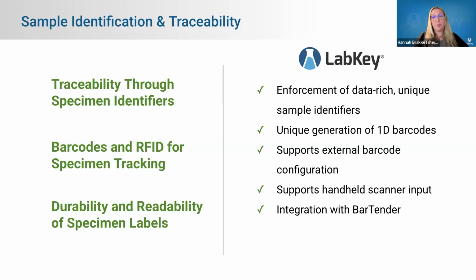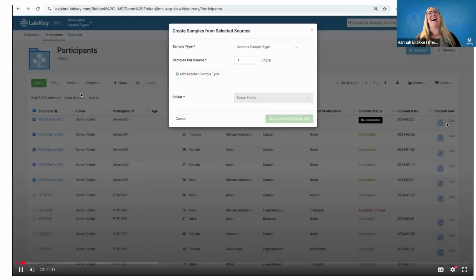So you don't have to buy new printers when you're choosing a solution. And so these are the things that we'll be showing in this video here. So let's see how we can do this within our software.